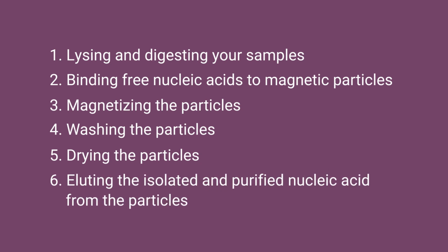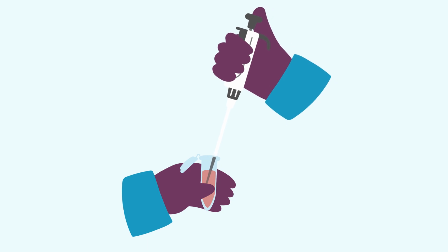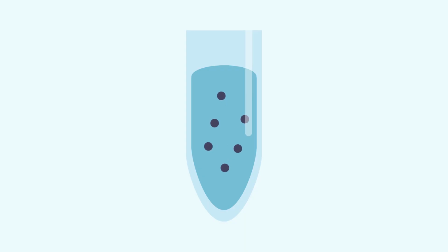However, if you develop each step incrementally using your manual extraction method as a control and optimize each step in sequential order, this process is much more manageable. After each step or series of steps with the robot, finish the extraction manually. This will let you assess the quality of the automated step compared to the manual control. You can save time if you visually inspect that the basic criteria are met at each step. For example, make sure particles are suspended during a binding or wash before moving on.